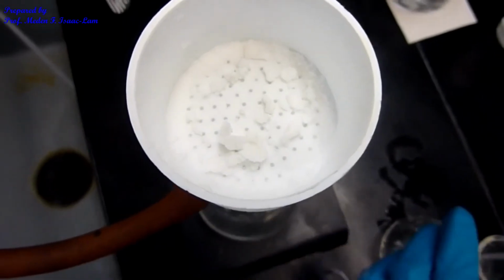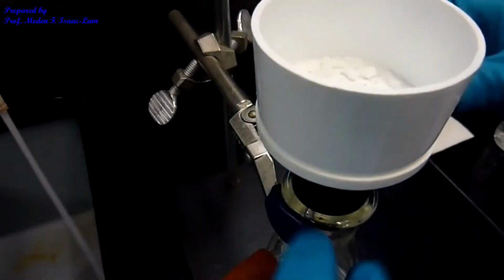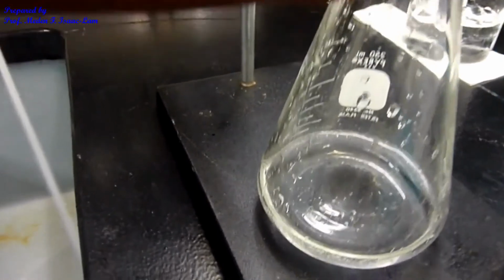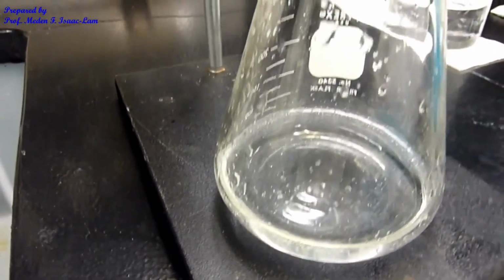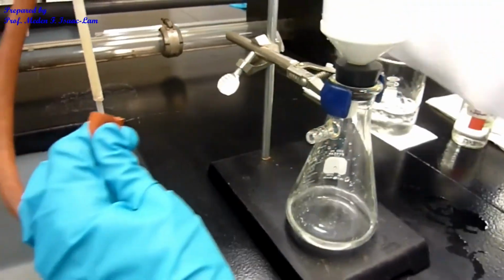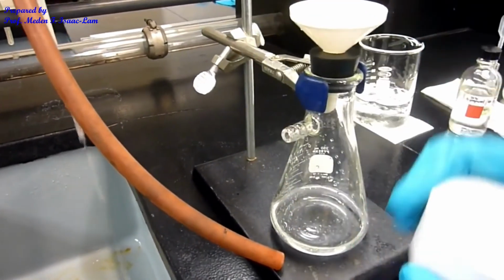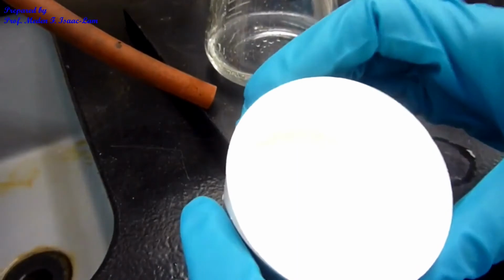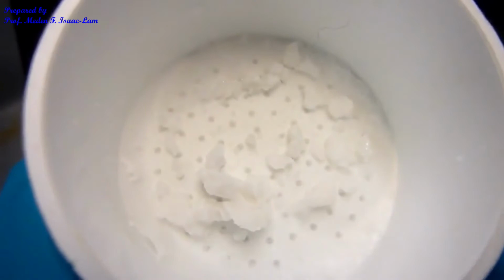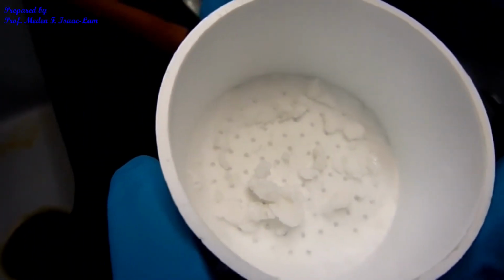Okay, so that's about it, and no more water going through in the filtrate and no precipitate that went through, and I'm just gonna turn off the water aspirator, and then we're done with the filtration. So this is now our product. We're gonna let it dry for a week, and then we will weigh this when it's dry, and then we will do more analysis for this next time.